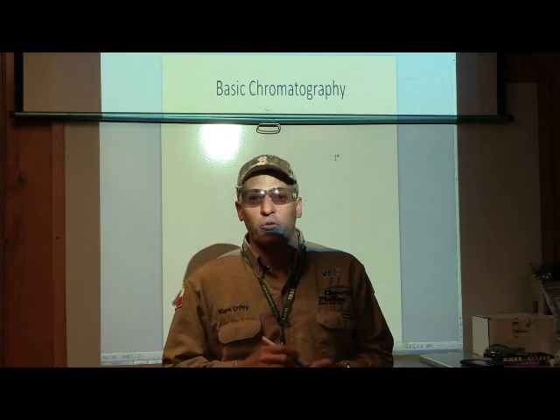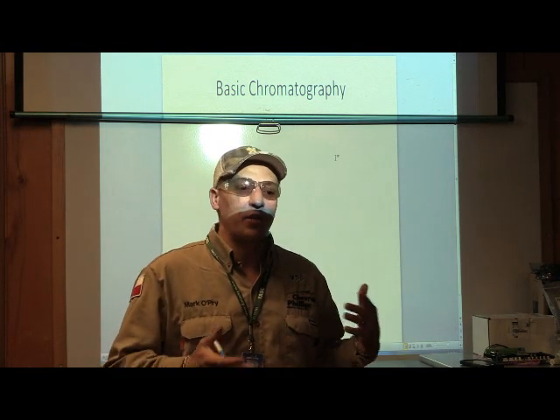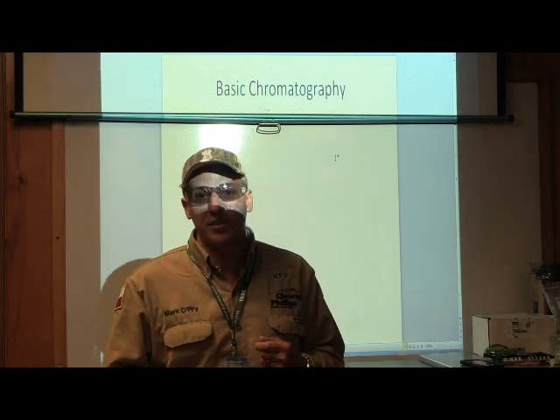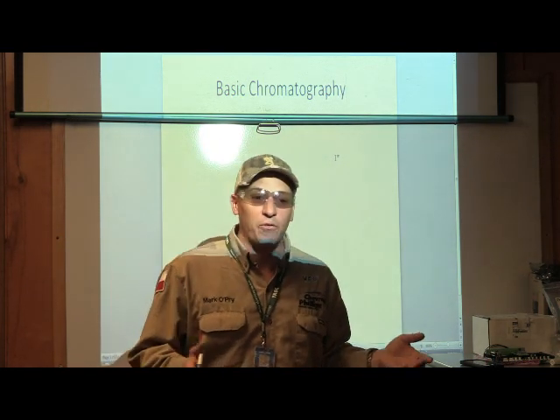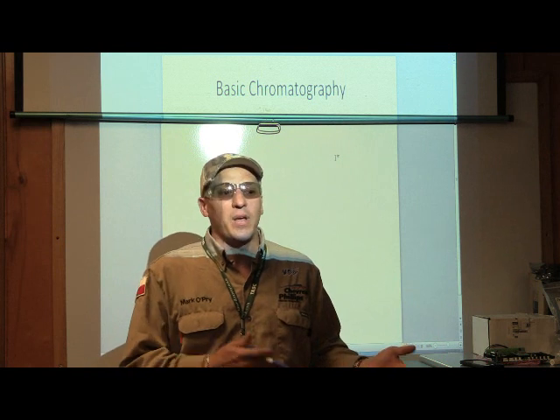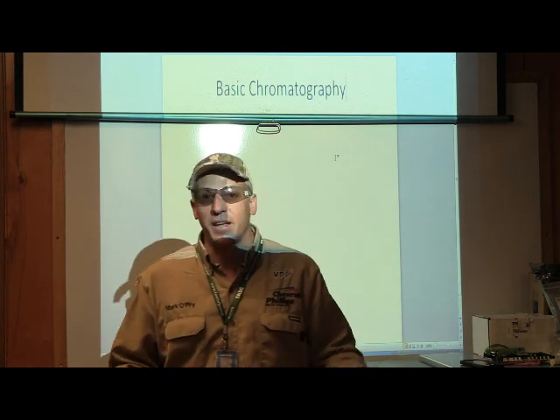Let's begin with some basic chromatography. Before we start talking about basic chromatography, we have to understand some of the makeup that goes into the gases that we're trying to separate and therefore measure. First thing that we have to know is some of the basic building blocks of how we make things up.